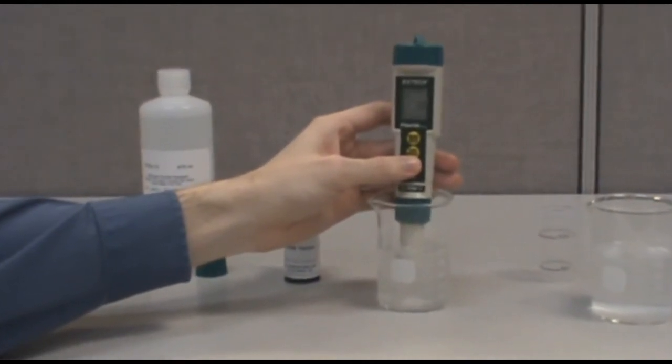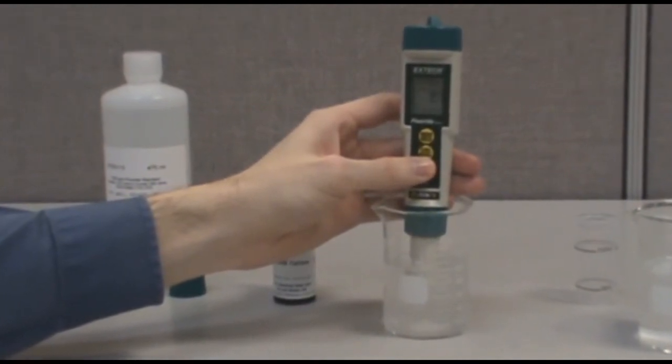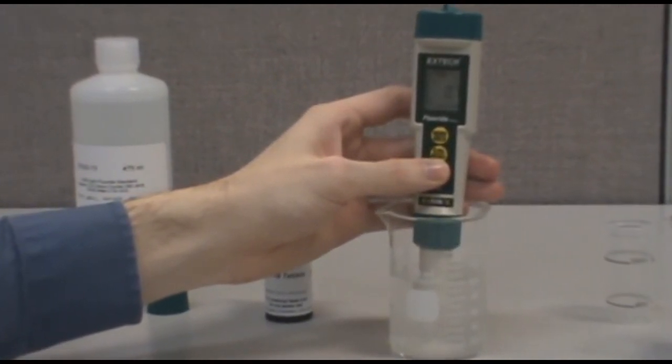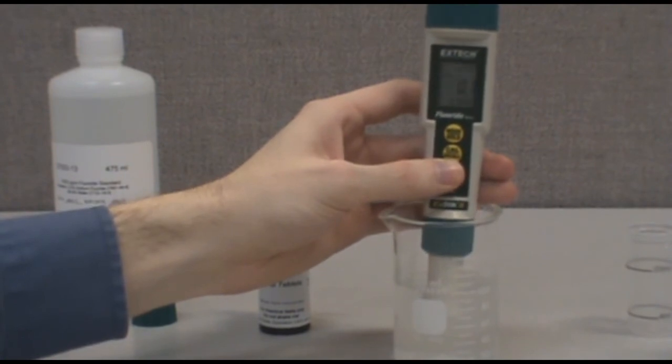Our sample reads 0.7 parts per million. Please note that your reading will be different from the value we have shown, since different water supplies will have different fluoride values.